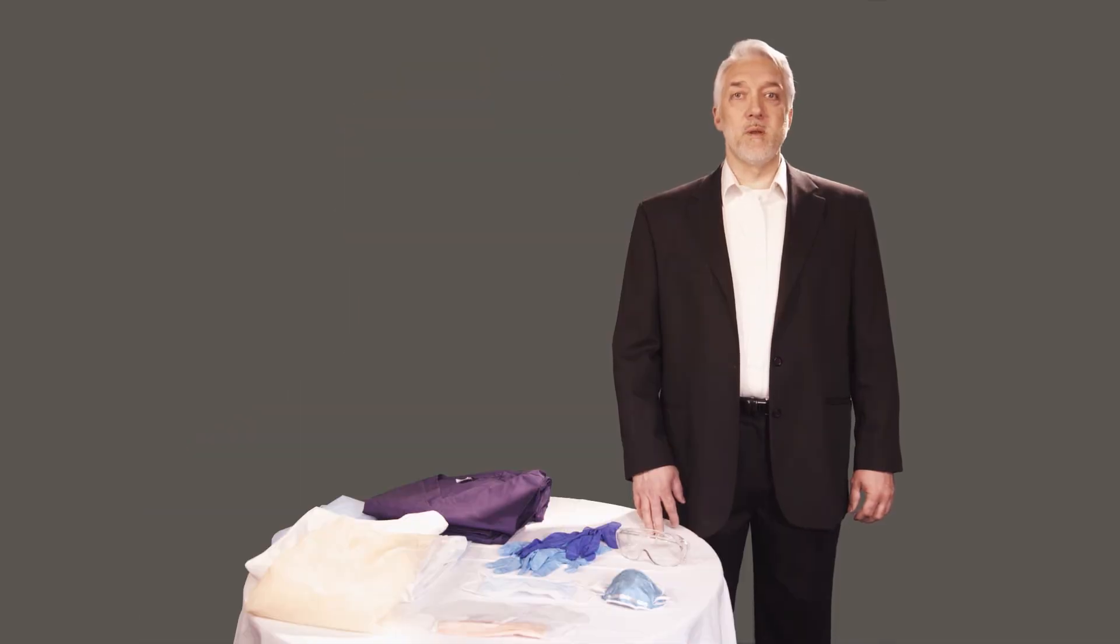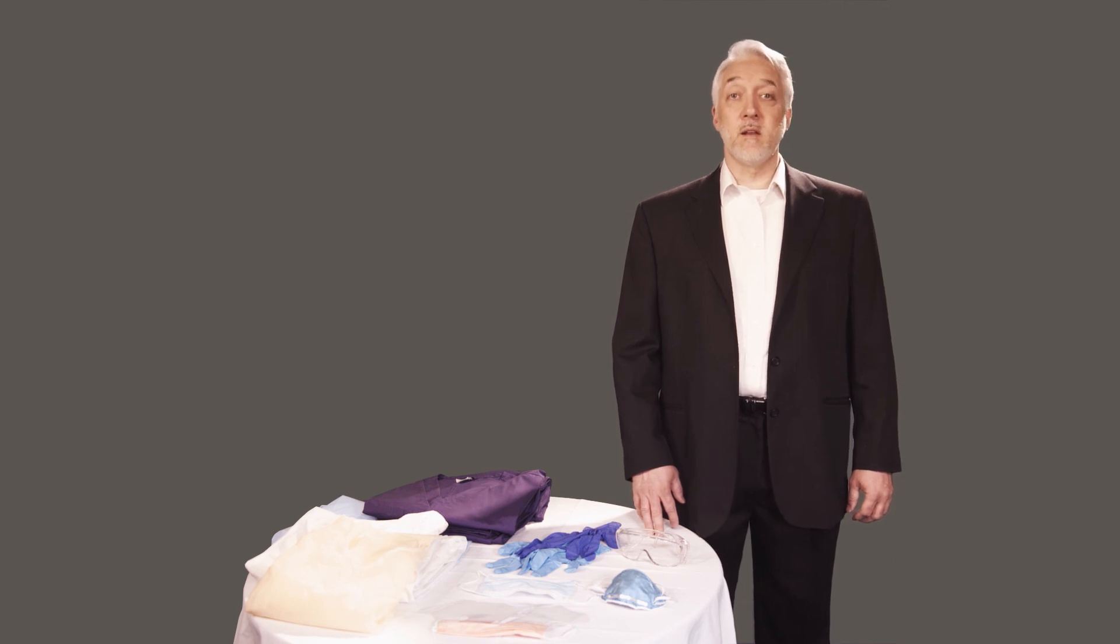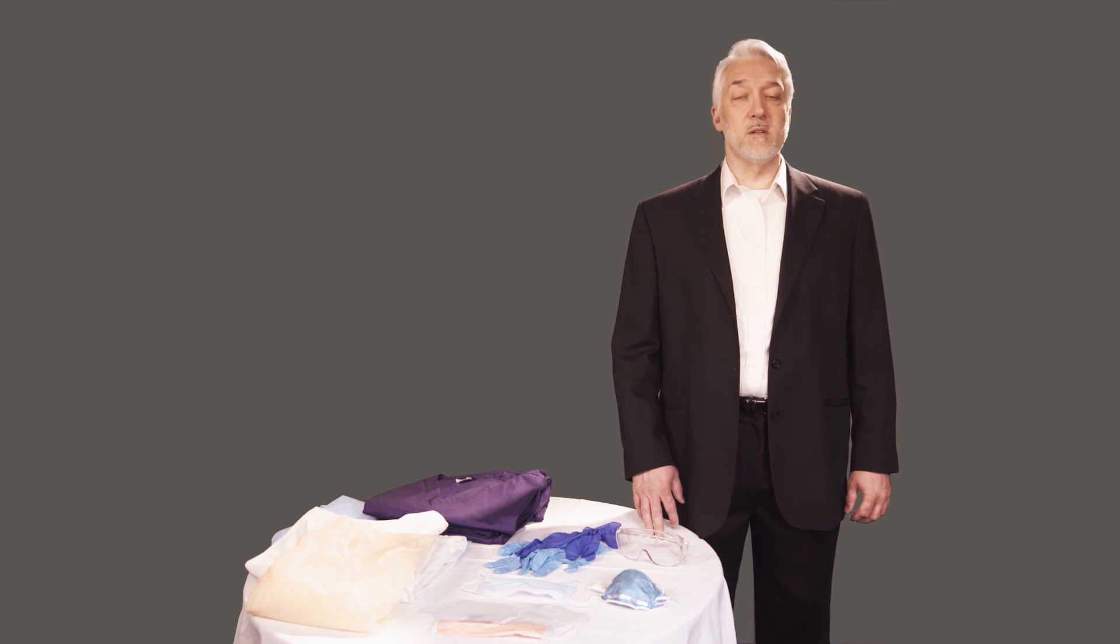Used PPE must be placed in a designated area or container for washing, decontamination, or disposal. And finally, under no circumstances are employees allowed to take home contaminated PPE.